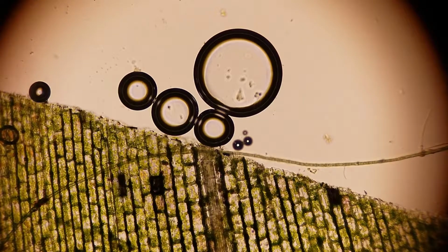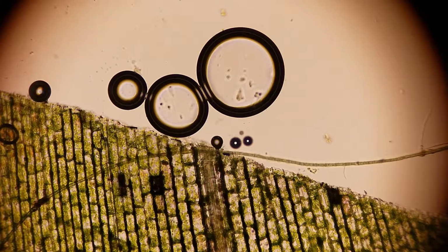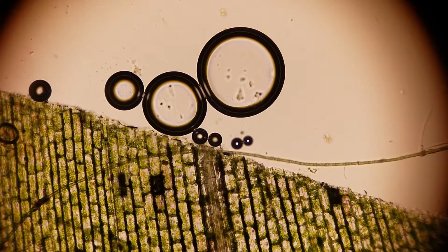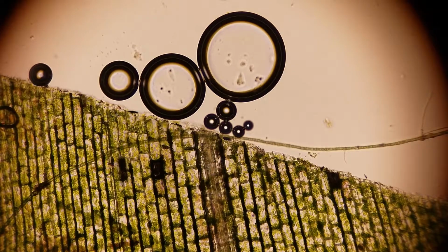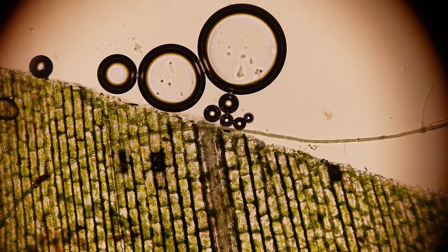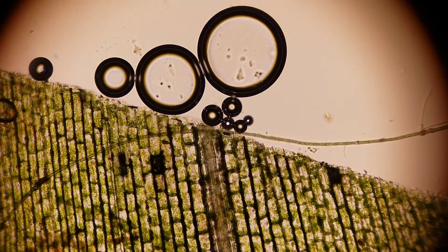Now I would hope that what we're seeing are the cells still going through photosynthesis where they produce oxygen. And I have seen this with algae, but that's only in time lapse, where they take a few minutes and speed them up. Then you can see bubbles of oxygen coming from algae. And of course you would see the same with this plant. But I'm not sure that's what's happening here, because it's happening so quickly. Either way, this is very fun to watch.